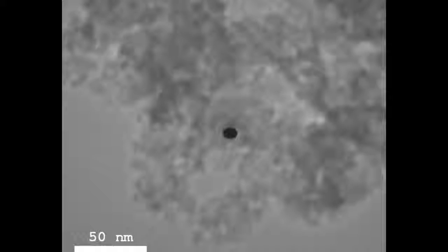But you need to remember one thing here, and that's that the bright and black regions don't reflect the particles. This is a phase contrast image, and it's an interference of the electron beam. Depending on how you turn the focusing knob, the atoms in this phase contrast image can either be white or black.